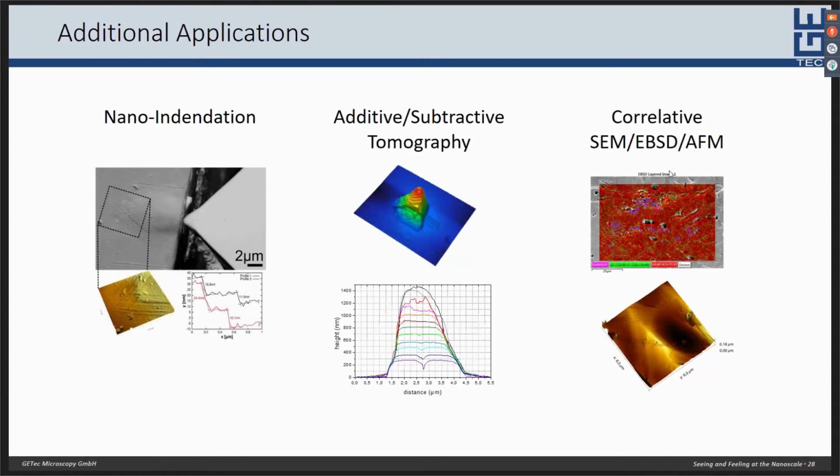By using the AFSEM, many of our customers are now able to perform interactive correlative analysis, which provides them with new insights into their sample's properties. The correlative and complementary AFM-SEM information helps them to advance, for example, in the field of basic science and technology, as well as improve products in industrial applications. I hope in this webinar all of you gained important insight into the variety of new possibilities which arise due to the correlative analysis capabilities of the AFSEM in an SEM.